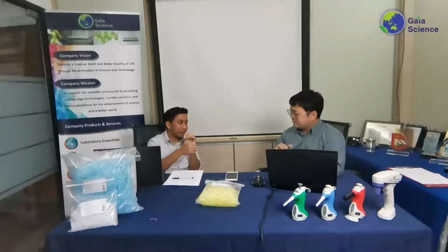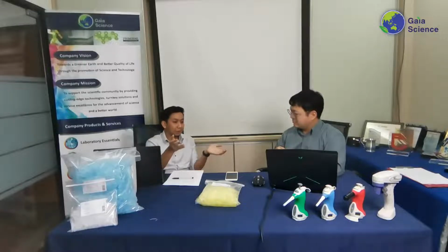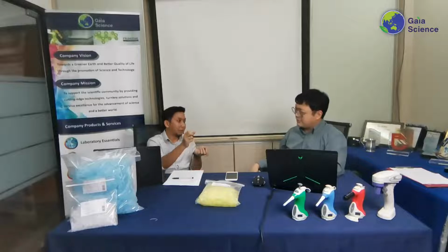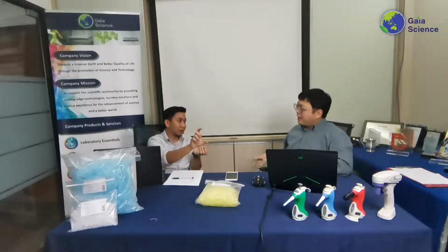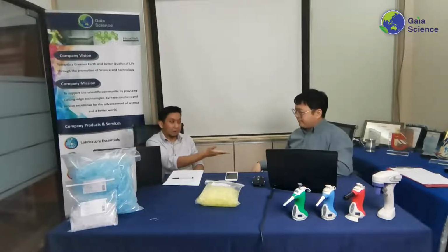They might aspirate accidentally more than the pipette can hold. And somehow, let's say you're trying to aspirate, sometimes you can go beyond the pipette level, right? Of course. Your pipette can hold 1000 microliters, but sometimes you can actually aspirate more. If you release too fast, then the liquid will go up. But if you have a filter, I think this is something that can be avoided.